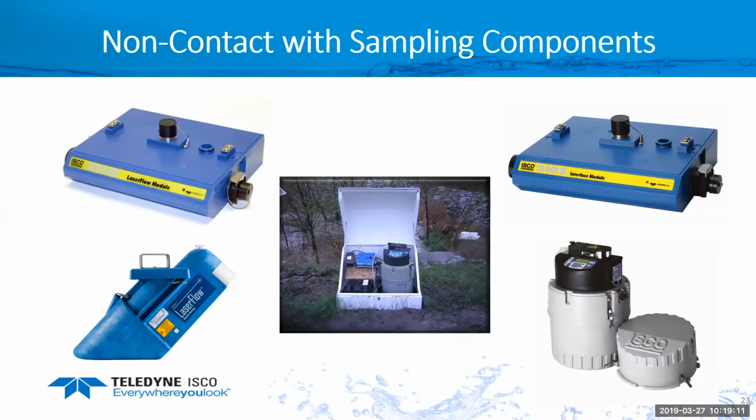In the center picture here, you can see we have a 2160 and a 2105 stacked. We have a modem off to the side, which we're going to cover later, hooked up to the sampler, and that's all in a storm box. The laser and the submerged probe and whatnot are all way down by the water.